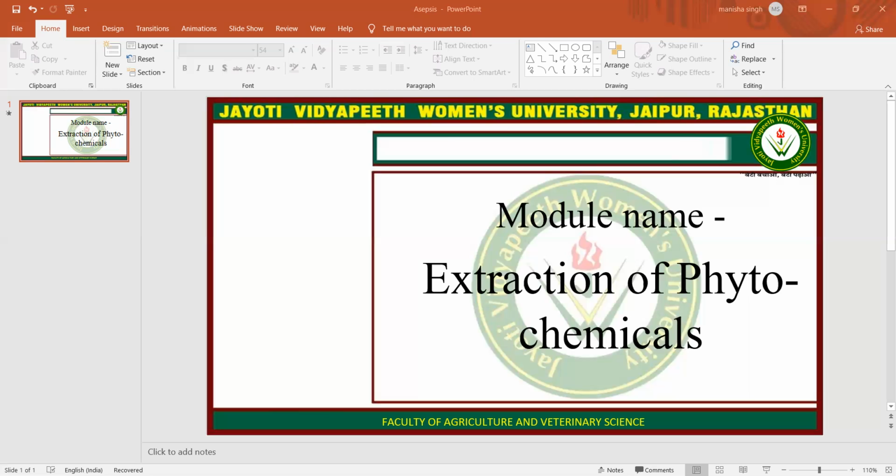The solid mass thus obtained is pulverized and used directly for the desired pharmaceutical formulation or further processed for isolation of its phytoconstituents. Next is the drying. The filtered extract is subjected to spray drying with a high pressure pump at a controlled feed rate and temperature to get dry powder. The desired particle size of the product is obtained by controlling the inside temperature of the chamber and by varying the pressure of the pump.